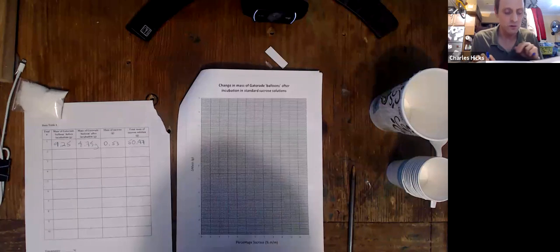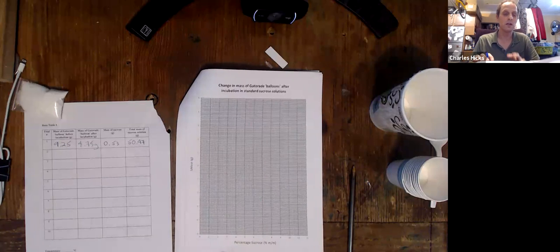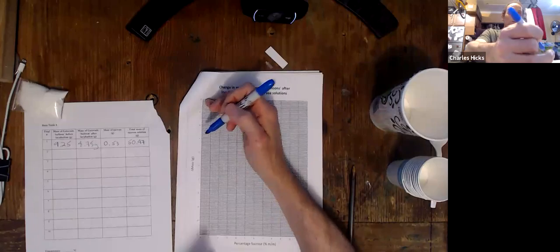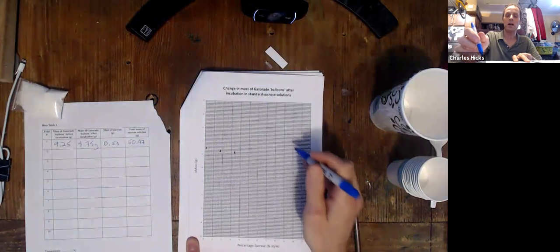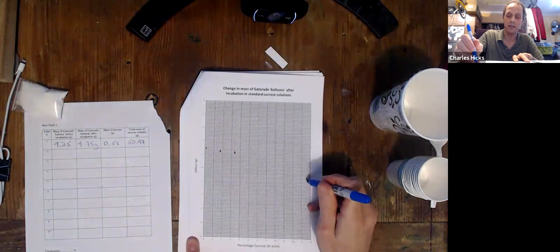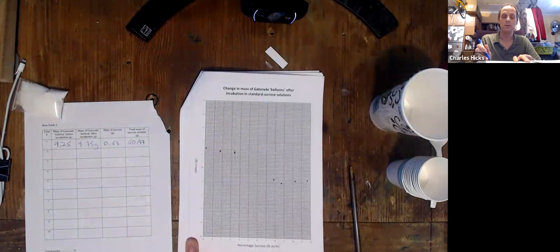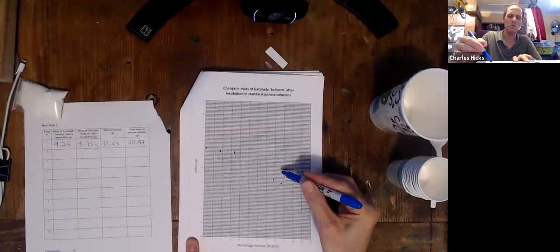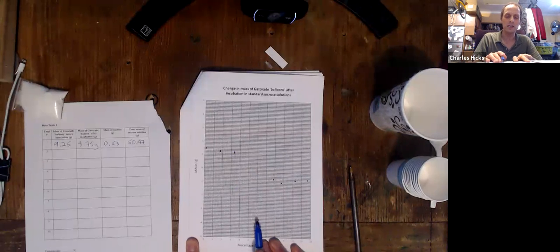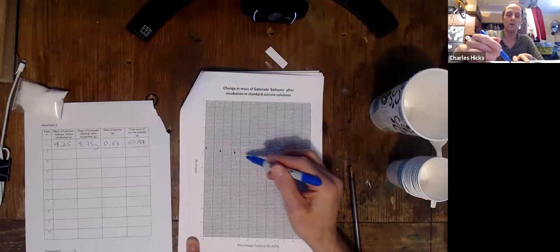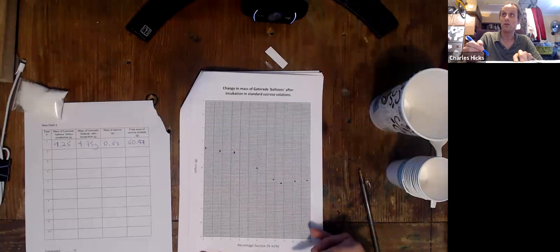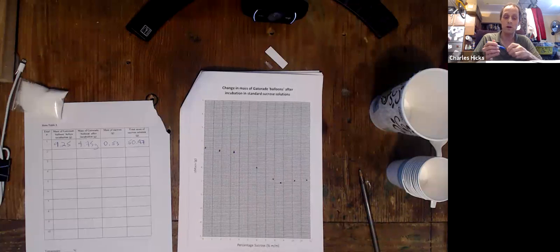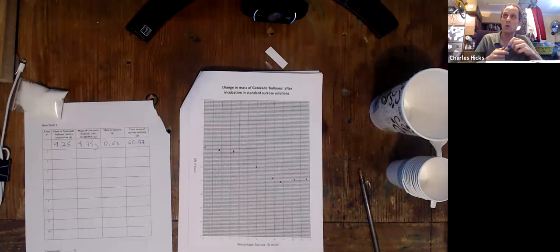It's most likely that what you'll see is the solutions at somewhere in the lower percentages will have tended to gain mass. So you might see some dots on the page that might look something like that. And somewhere towards the higher end, you certainly will see ones that will have lost mass. Maybe a little bit of random error in there. And somewhere in between, we want to determine what is the percentage at which this graph looks like it crosses zero grams lost. Whatever percentage that is, is the percentage that corresponds to an isotonic solution that is isotonic with the Gatorade.